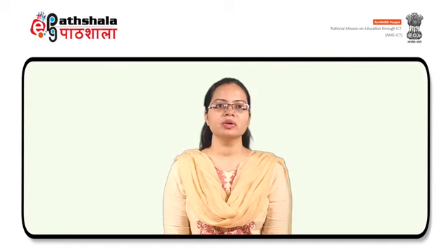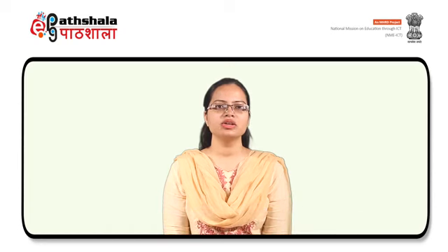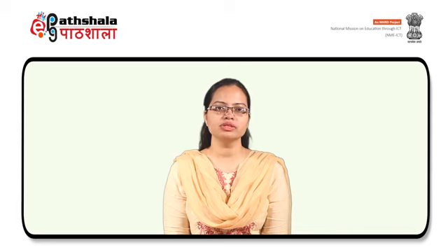In another technique, we are going to discuss the ex vivo studies in ocular drug delivery. The physiological structure, location and sensitivity of the ocular surface predispose it to hazardous exposure from different materials and chemicals, including household, industrial and agricultural products, cosmetics and even certain ocular drugs and pharmaceuticals if incorrectly administered. This can result in damage to the cornea varying from irritation and inflammation, resulting in mild discomfort to ocular tissues, and may even lead to irreversible blindness.